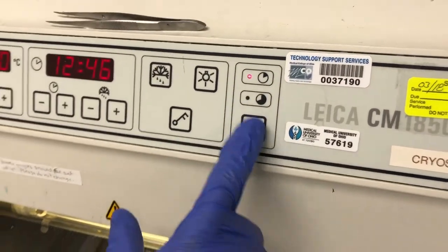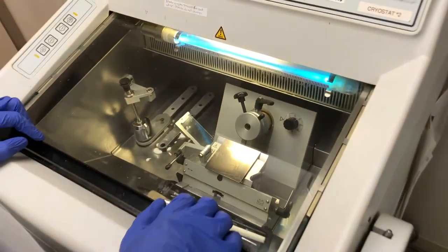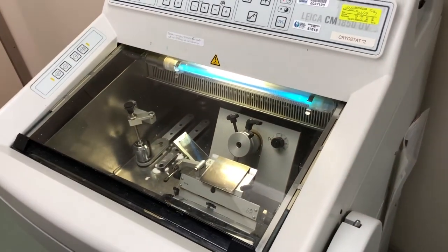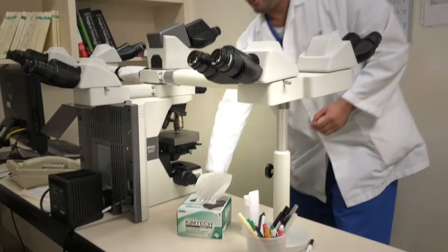Press the UVC button to turn on the ultraviolet light which helps to clean the machine. You are now ready to view the slides under the microscope.